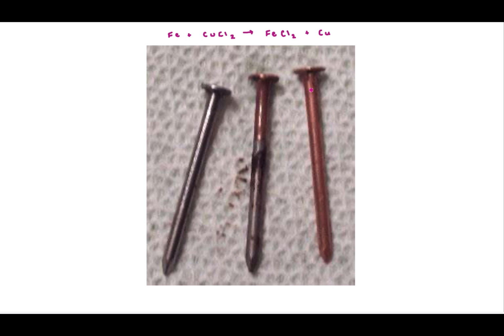Well, when I originally put the nail in, it kind of has this silvery looking color to it. Okay, and then when we allow it to react with the copper chloride solution, what happens is the iron is going to be kicking out the copper, right? So the iron is going to form a solution with the chlorine, and what's going to be left as a solid on your nail is that dark color copper. So that's why your nails turned a darker color, because it was copper being deposited on the nail itself. As iron was kicking the copper out of solution, the copper was able to form a solid on the nail.